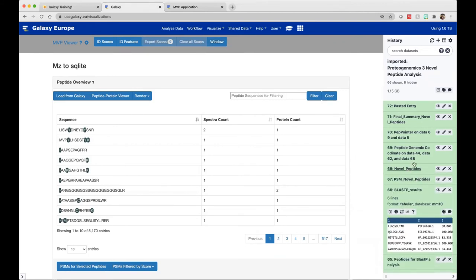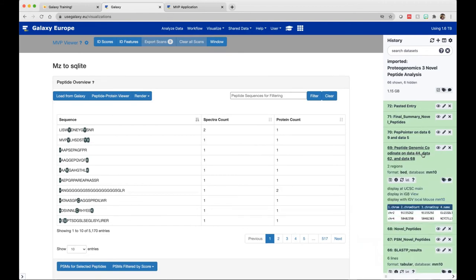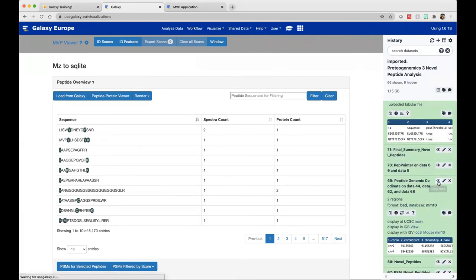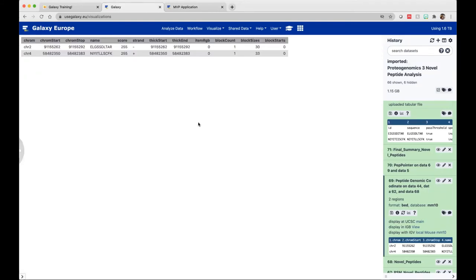The next information we have added is the peptide genomic coordinate tool. The peptide genomic coordinate tool will look at the peptides involved with better spectra. As I already saw there were two peptides with good spectra, it will output those peptides. If you click on the eye icon to view, it is giving me the two good spectra peptides, their chromosome information, chromosome start and stop, strandedness, score, thick start, thick end, and some other information regarding the peptide. This is a BED file. As mentioned before, MVP can open BED files, so you could load this as a track on MVP.